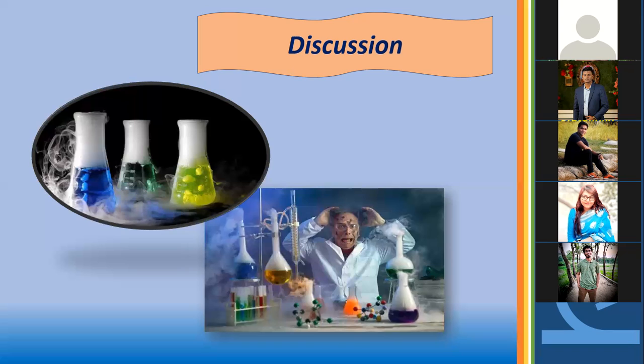In this experiment, we did a reaction between sodium hydroxide and acetic acid, where sodium hydroxide is very hazardous in case of skin contact, eye contact, and inhalation. It can even damage the cornea of our eyes or cause blindness, and can produce inflammation and blistering. An acid-base reaction produces a large amount of heat, liquid materials can splutter, and there can even be steam explosions. If there is any explosion, hydrogen gas and toxic gases can spread around our environment.